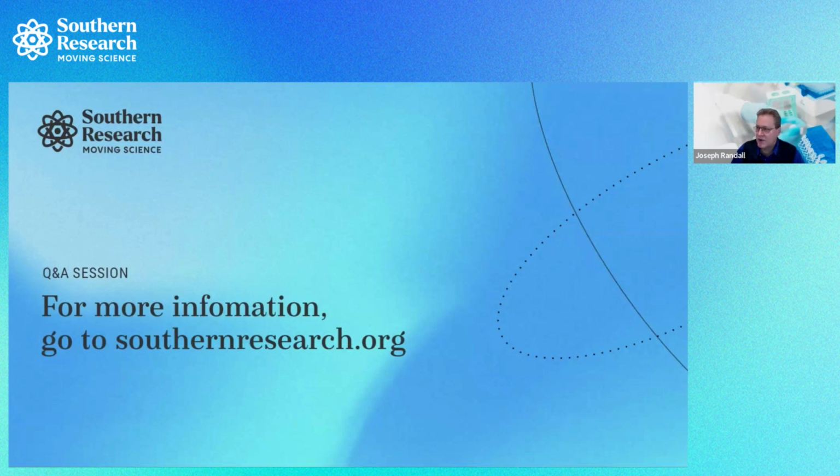So the stereotaxic coordinates that we determined for this study were based on 2 to 3 kilo monkeys. And in one of the references, the XYZ coordinates in that paper that's referenced, those coordinates will change depending upon the size of the monkey. So your question is a very good one. Thank you.